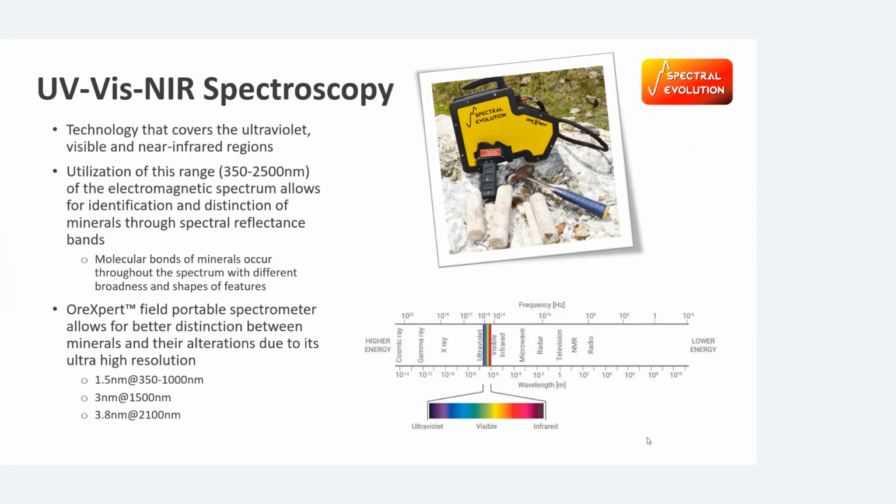Again, there's plenty of education for those who are beginners on this. I would keep in mind that the instrument that we are using for this study is the highest spectral resolution field portable spectrometer in the world. So some of you who may be beginner users might be using standard spectral resolution, which is going to be a lot less spectral resolution than what we used in this study.